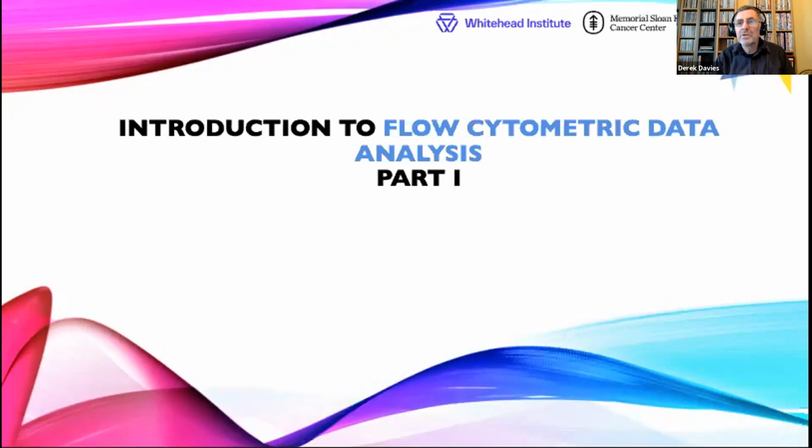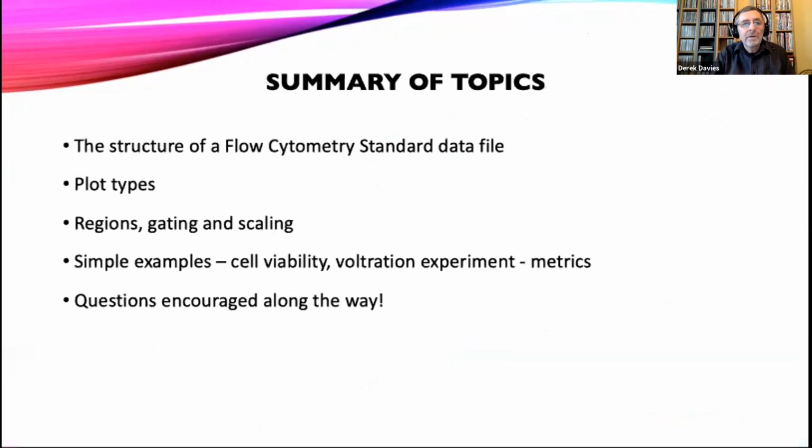But the principles that we are going to look at today will hopefully help us in all types of data analysis. So what are we going to do? Okay, so we're going to go live in a minute, and today we're going to use FlowJo for our analysis.